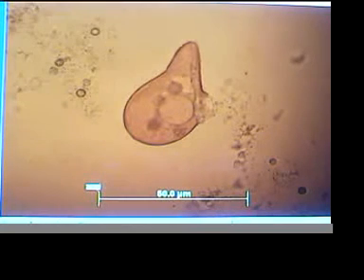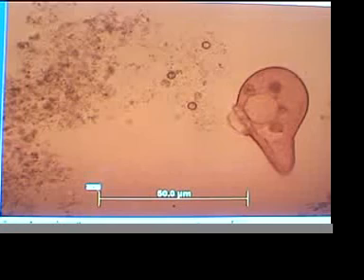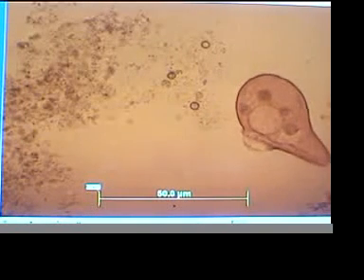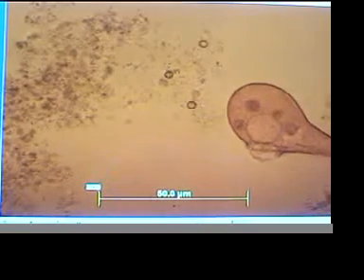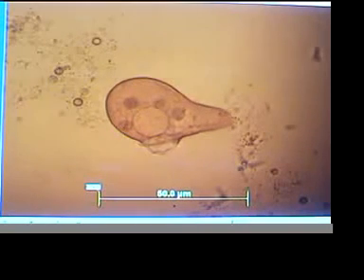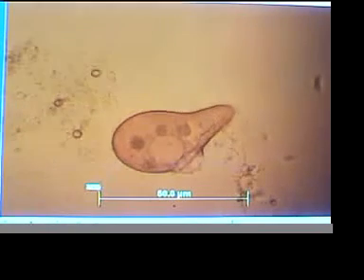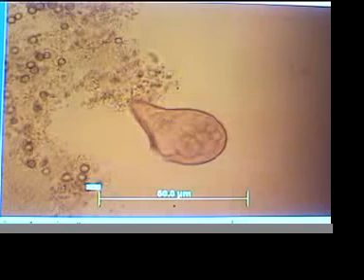This guy's taking his good sweet time here. And it turns out this is grid 7H. Grid 7H. Consider that for you a little bit. He's struggling along in grid 7H, as is his partner here, also with a distension here.